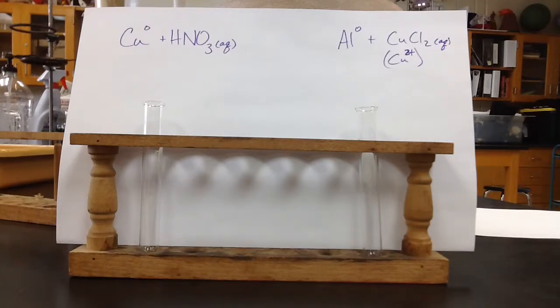On the left-hand side of your screen, we're going to be looking at the reaction of copper metal and nitric acid, HNO3. Nitric acid is 8 molar. It's very strong. I definitely do not want to get anything on you. And then the other reaction on the right is going to be aluminum metal and a 1 molar copper chloride solution.